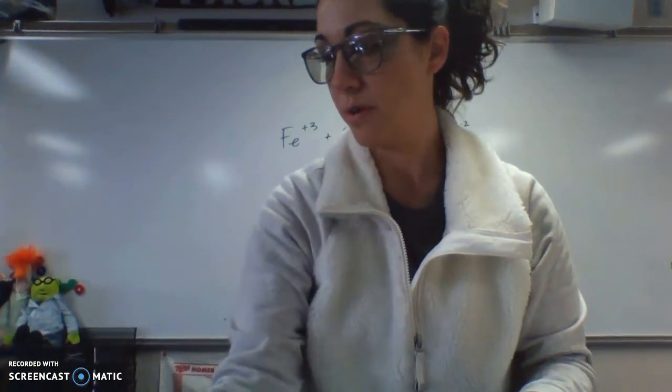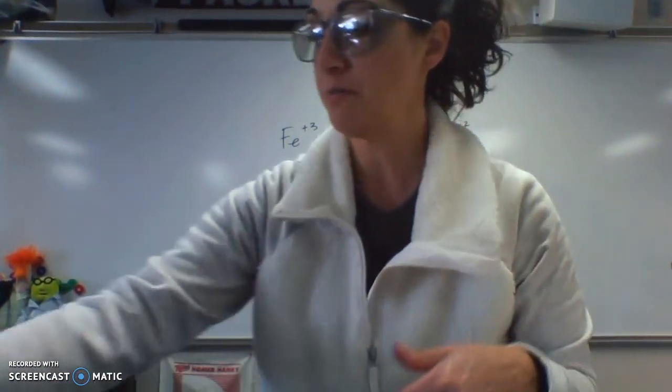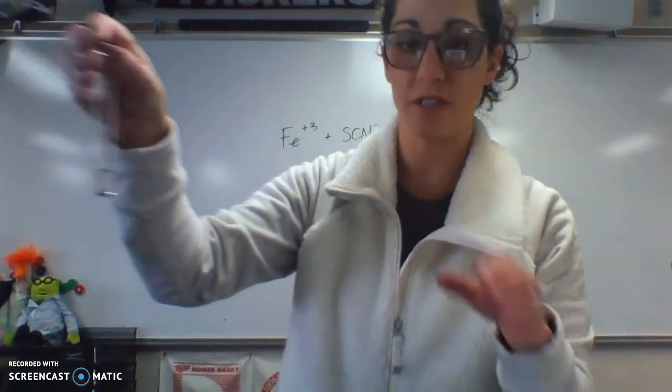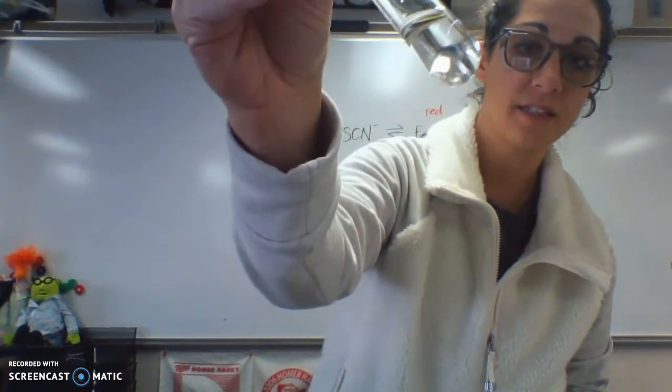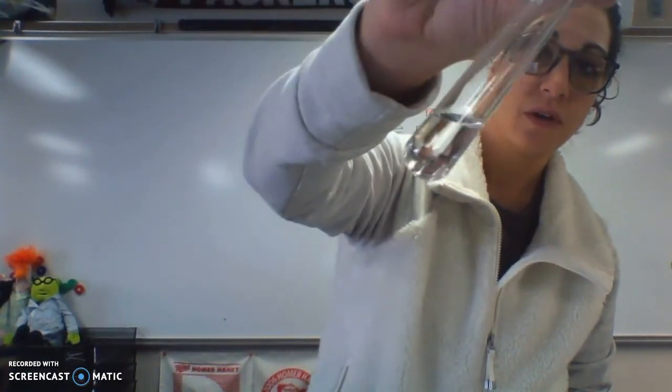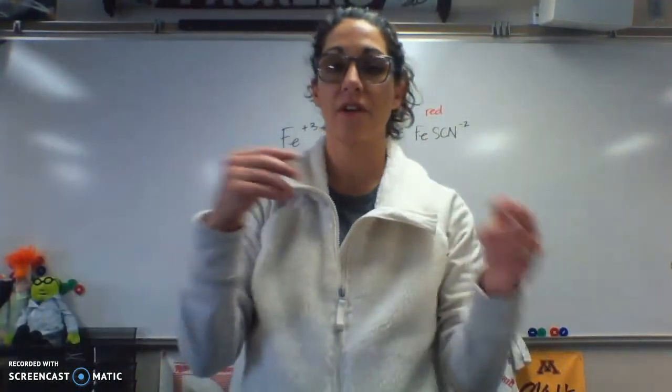Okay. So one last thing, let's finish part A. So part A, I had to warm it back up to room temperature. So I did. So it had crystals after it cooled. And now that it's warmed up, it's dissolved again. So knowing that this is an endothermic reaction, we can figure out which way it's shifting.